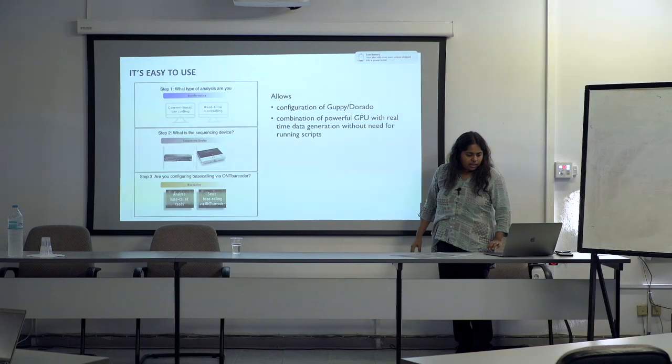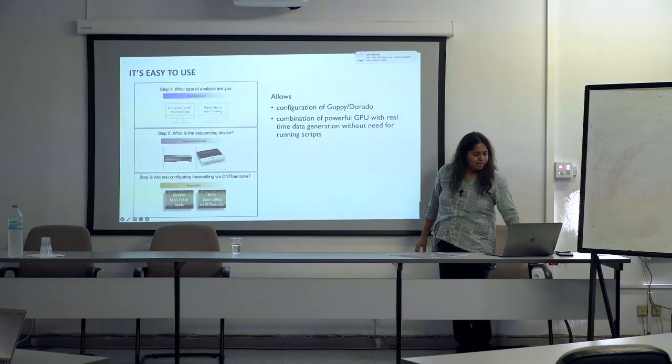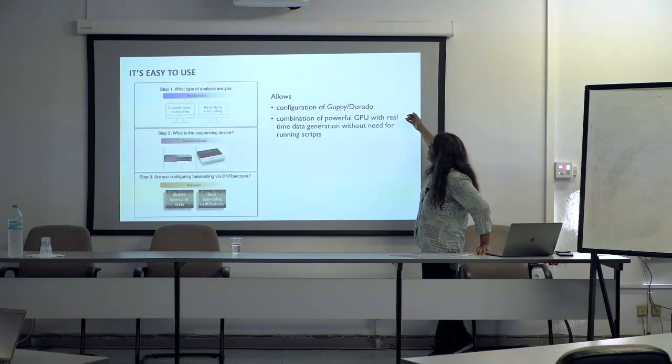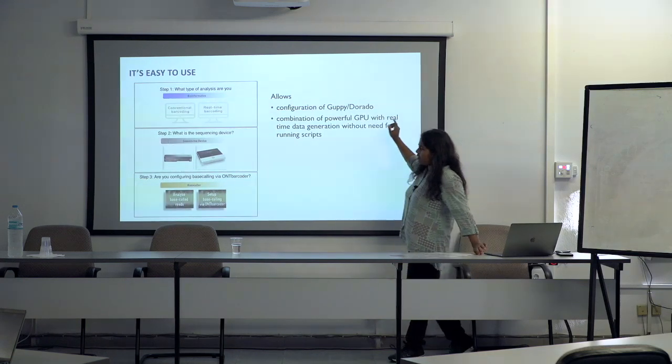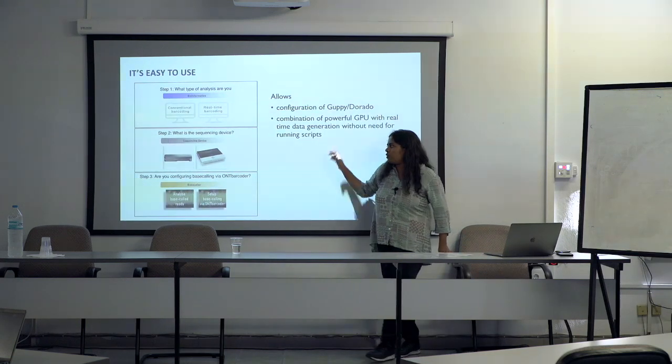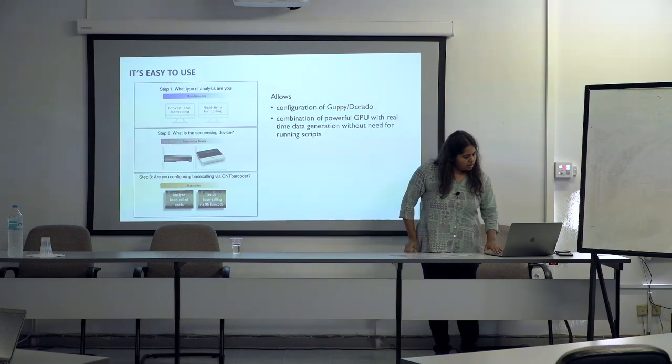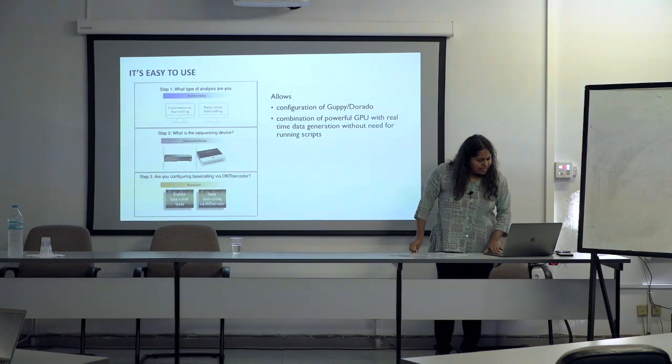Sorry, my computer might die, but you can combine a powerful GPU in a separate computer if you are sequencing this way, if you have that. And that's about it.